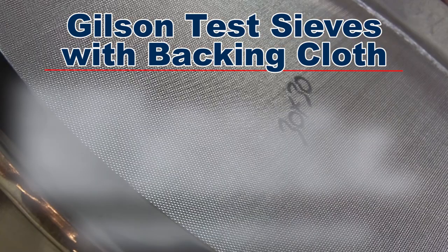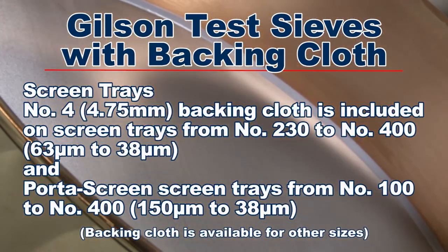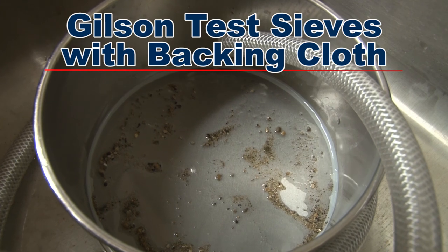Backing cloth, available for test sieves or screen trays, is a Gilson add-on option, especially when ordering wet wash sieves.